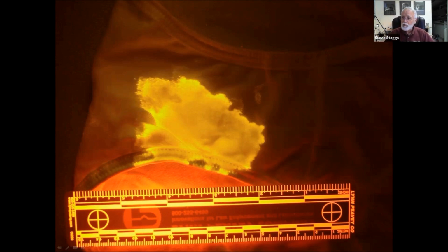I want to make sure my focus is just dead on. And by the way, resist focusing on the scale. Now you're trying to get the scale on the same plane as your evidence. But remember, on a lot of these things, our depth of field is very shallow. When your depth of field is shallow, if you focus on the scale and the scale isn't exactly on the same plane as your evidence, your evidence may end up being slightly out of focus because of your shallow depth of field. It would be better that your scale just be a tad out of focus as long as your evidence is in sharp focus. So especially something like a fingerprint. I don't want my scale to be perfect if that means my fingerprint will be slightly out of focus. I need my fingerprint to be the best.